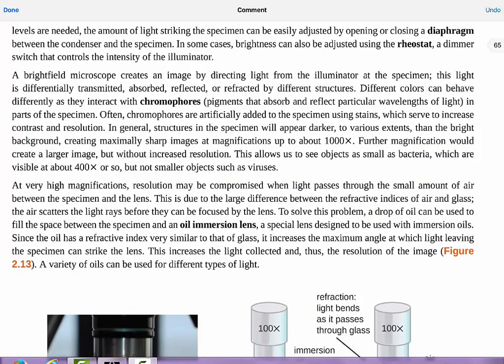So even though you may be moving up to a higher magnification, at that point you don't want to change that. It's going to be a huge switch when you're looking at something at those higher magnifications. Doing even something tiny with some of the parts of the microscope really makes a huge difference because you're so far zoomed in.